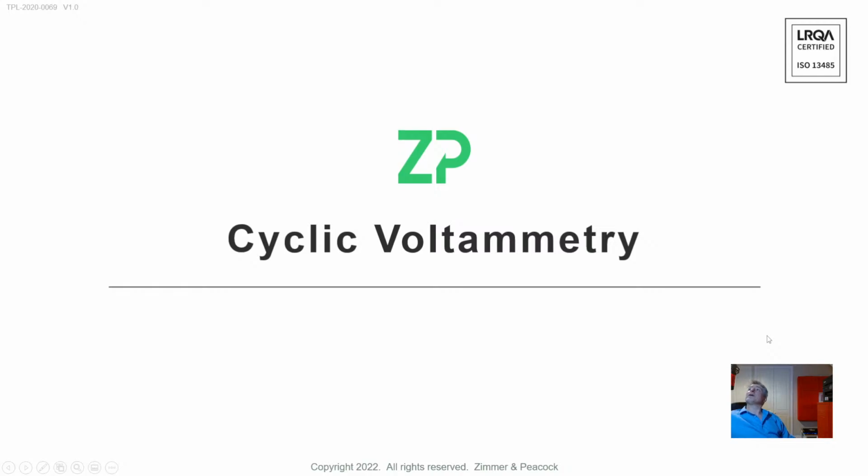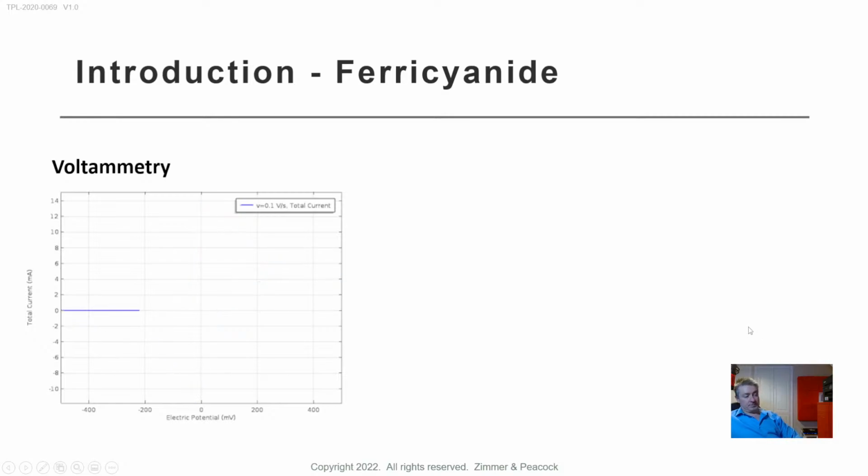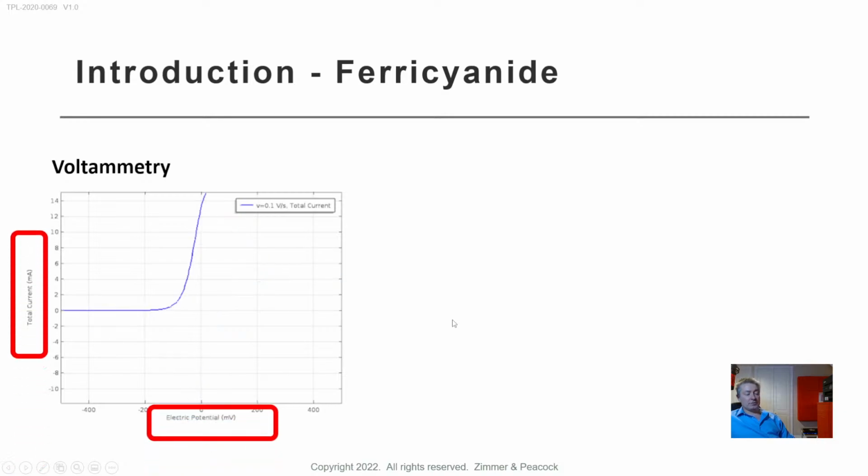Cyclic voltammetry, I'm going to talk a bit faster this morning. It's 8:20 now. People hold cyclic voltammetry and expect it to look a very certain way. Rather usefully, I realize I'm using the cyclic voltammetry of ferricyanide, which is kind of useful, because I realize I mentioned minus 250 millivolts earlier on. And that's because it's well negative of the reduction peak from ferri to ferrocyanide. So here's the cyclic voltammetry. Obviously current versus voltage. If you're not sure about this, have a look at the ZP Academy.